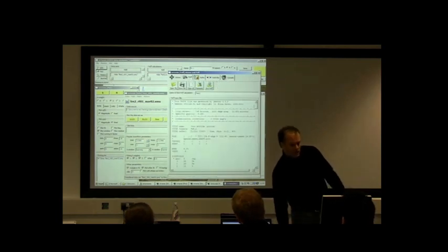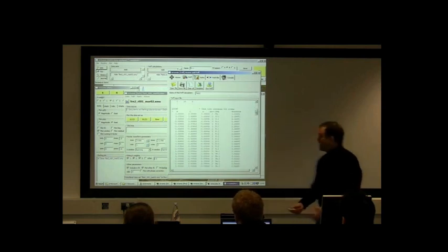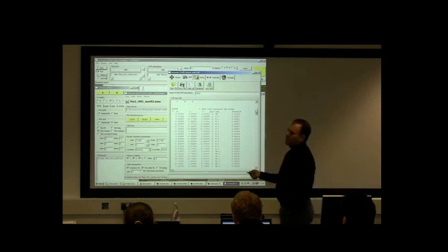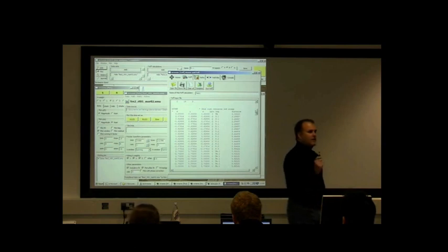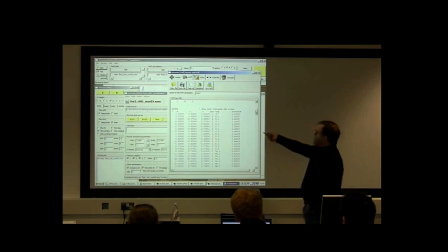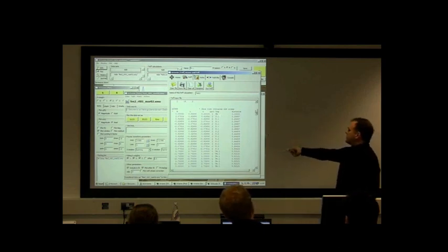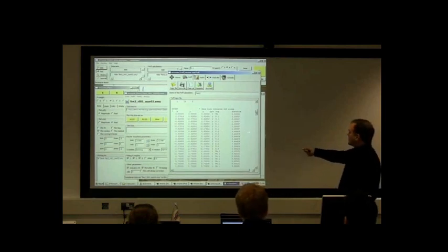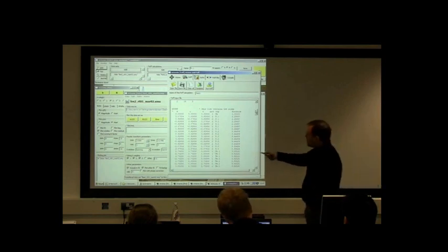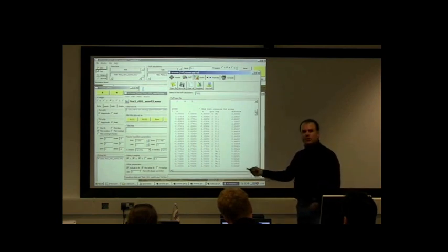So the crystallography stuff happened, and it made a big list of atomic coordinates. And this is the kind of information that's needed for the theory. The theory needs to know a big list of atomic coordinates. So we have an iron atom at the origin, and surrounding it are a bunch of sulfur atoms at 2.3 angstroms, then a bunch more sulfur atoms at 3.4 angstroms, a couple more at 3.6, then there's a whole bunch of iron atoms. The data that FEFF is looking for are the Cartesian coordinates of all of these atoms.